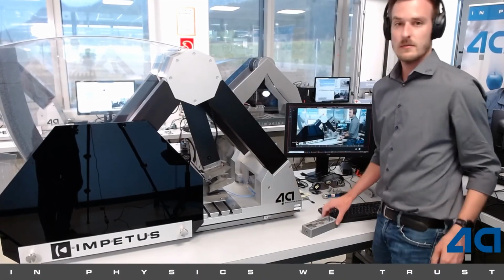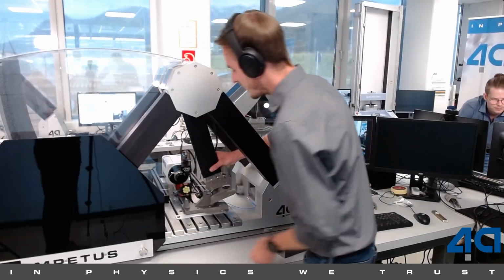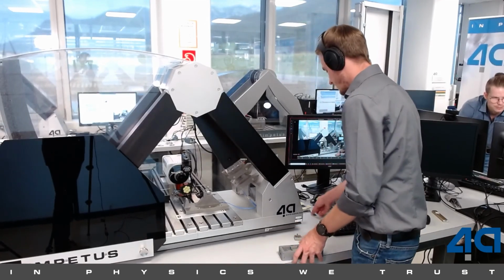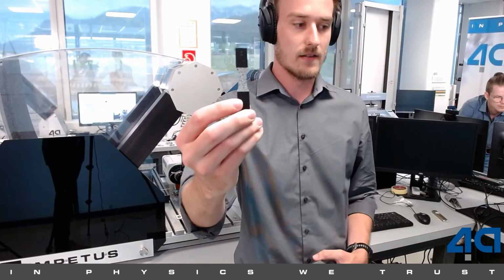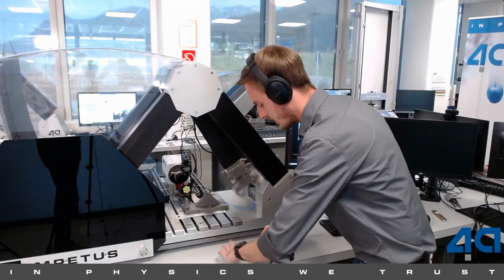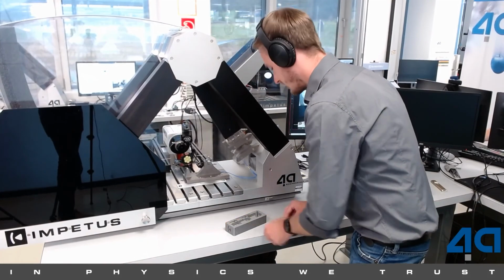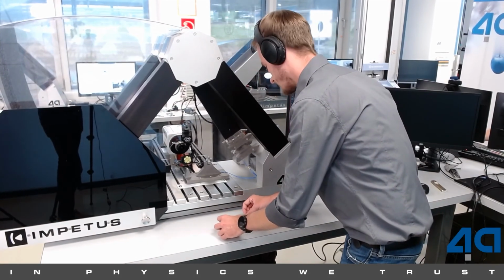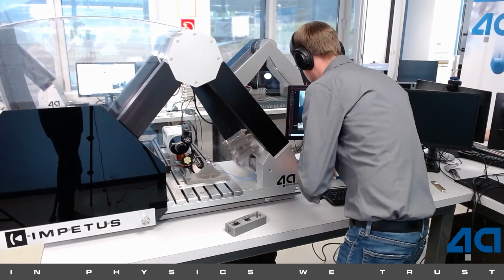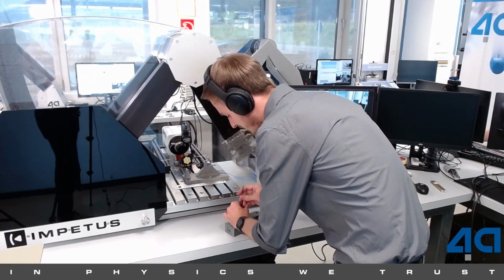Okay, so now we are here on the pendulum arm and the pendulum for the tensile test, as you can see here. What we have to do is to fix this prepared test piece with our chucks, front and back. So we insert it like that, put on the test piece and prepare the test. Just a few screws. It will go really fast.